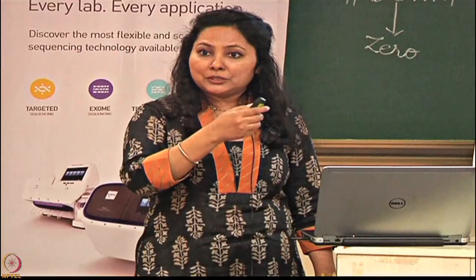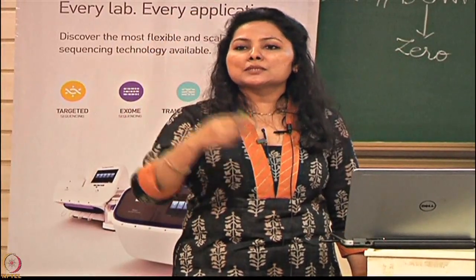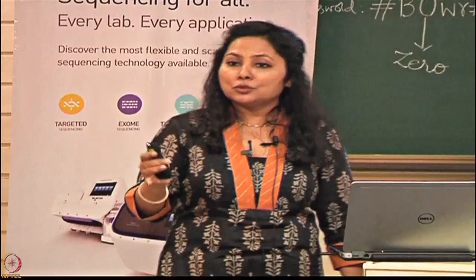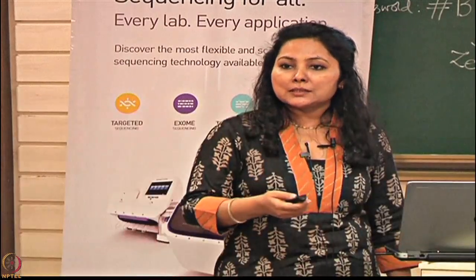If you look at pictures of the Sanger Institute during that time, there were lines of these systems generating sequences day and night, and that's how the first human genome got sequenced and assembled. So those were, I would say, benchmarks in sequencing.